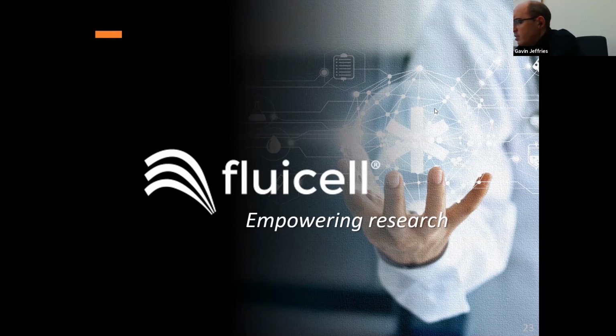So you absolutely can change the microenvironment. It really comes down to what the response time is. Typical environmental changes that we do are for triggering things such as ion channel experiments or for delivering drug compounds to cells of interest. This is done for seconds to minutes at most. Theoretically, this could be maintained for an hour or two without any problems. But from my understanding of when we work with the keratinocytes, you would need to be modifying it for quite a while to actually do that.